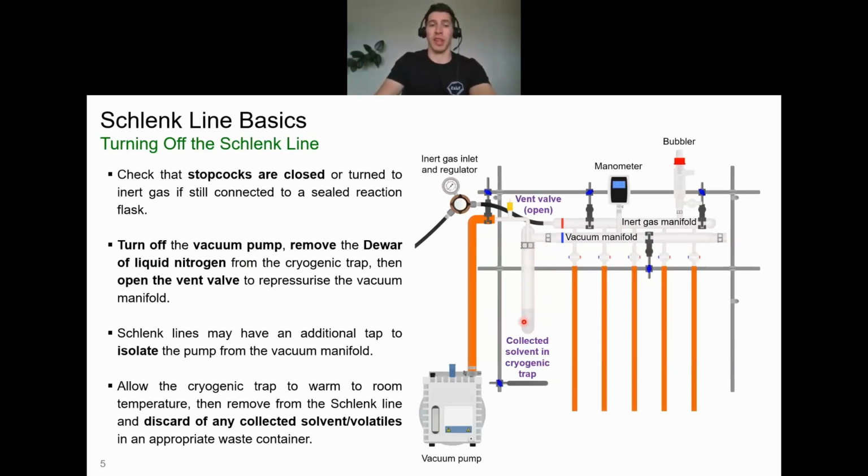And we can, of course, then discard any collected solvents in an appropriate waste container, rinse this out with acetone if necessary, and allow it to air dry overnight so that when we come to do our chemistry the following morning, it's ready for operation. Whereas if you leave it overnight, you have to do all that in the morning, and you run the risk that collected solvents here, if you don't have an additional tap to isolate the pump, can still evaporate into your pump oil.